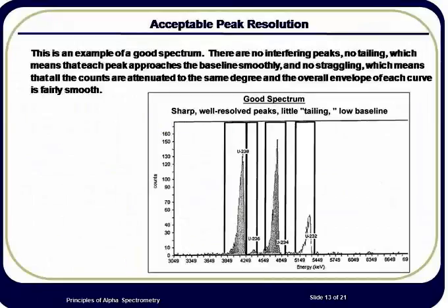The spectrum shown on this slide is for a sample containing natural uranium with uranium-232 tracer added. Note that the region of interest for each isotope of uranium encompasses one peak entirely, and none of the higher energy peaks tail into the lower energy peaks. When tailing occurs, this is also called spill down, the accuracy with which the peak areas can be determined is compromised. Depending on the extent of the tailing, the final sample test form may need to be re-prepared or the analysis may need to be started all over again.